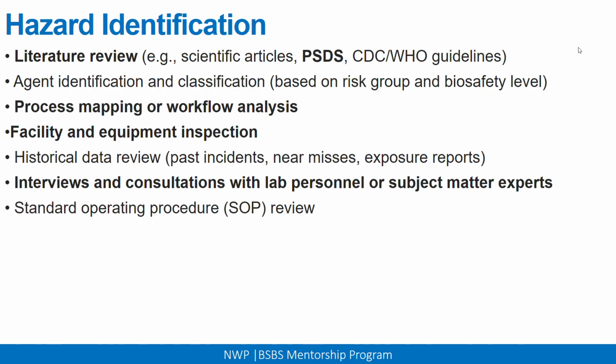Therefore, you may try to change the SOP and get something which may not expose people to injury or to the biological agents. You can get a sterilizer, and not use the flames and everything. So you look at the procedure itself, you look at the gaps in the procedure, and through that you close the gaps, and therefore people will use a procedure that has less risk of exposure.